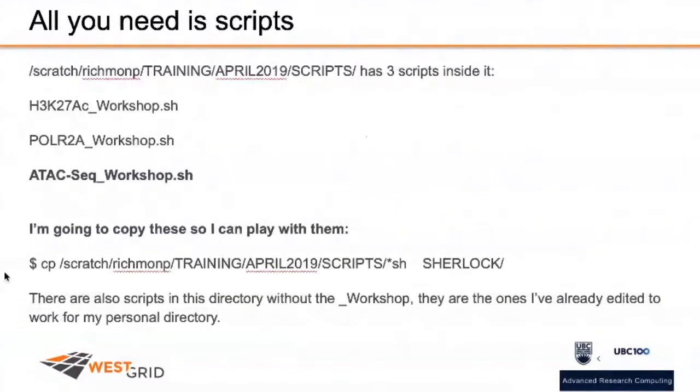What's nice is Dr. Forness has made these scripts for us, which include the ability to download data, create a directory, process that data, all in a single script. So these are already functional as long as you modify them to be relevant to your own account information, email address, and directory location. They should work just fine.